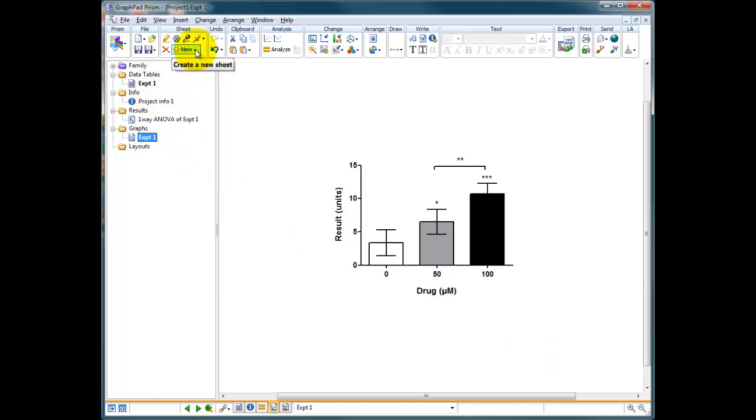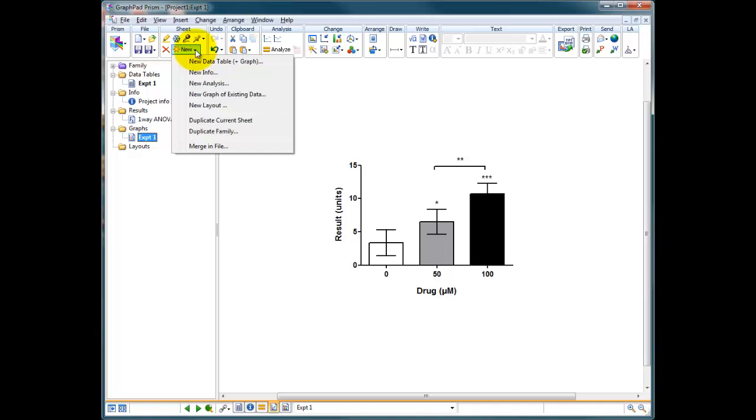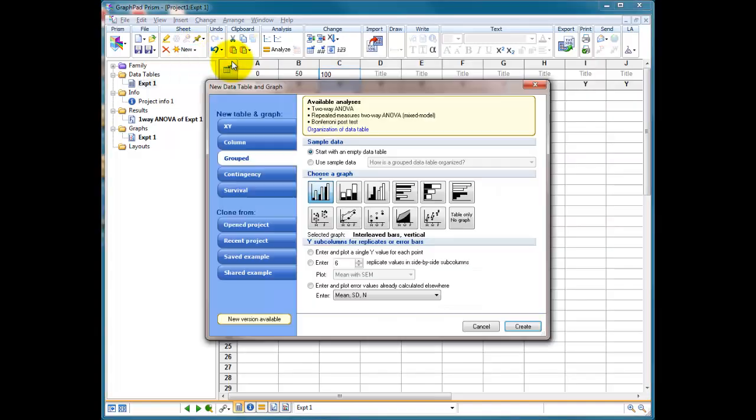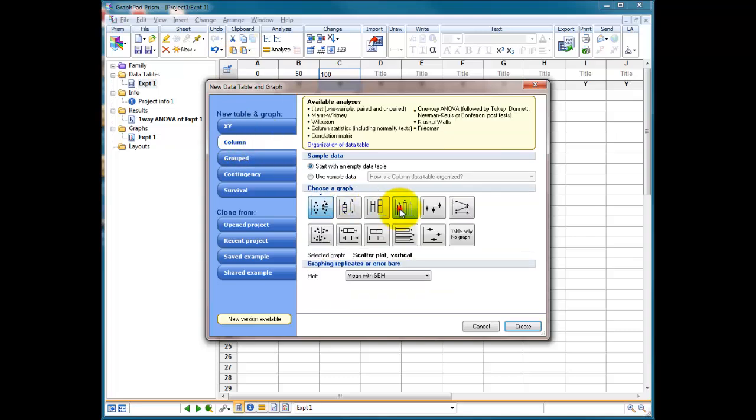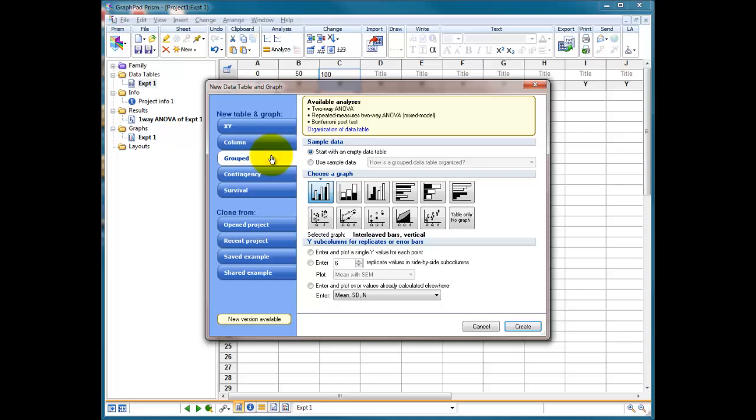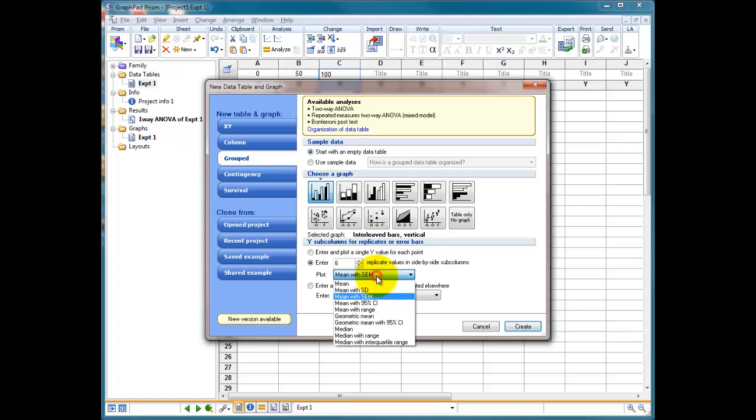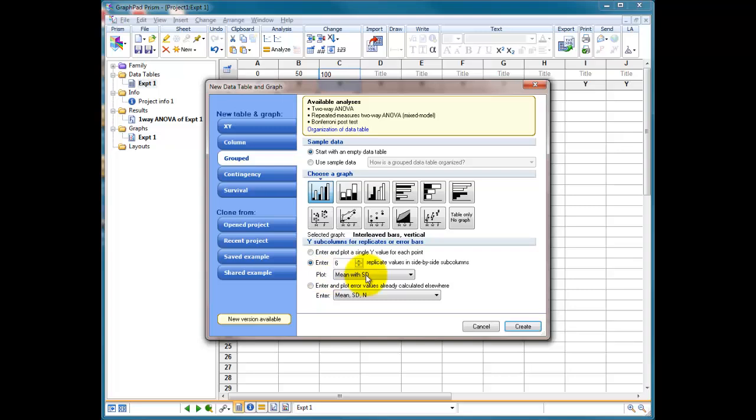So let's go to new and create a new graph and table for this. Click on new table and graph. And this time instead of being a column where we're choosing just a standard column, it's going to be a grouped analysis. So this time we're going to choose a graph and it's got a little picture here showing a white and a black bar next to each other in a group. And that of course could be your 0, 50, and 100 micromole with and without your inhibitor. Down the bottom here it's asking us now how we're going to enter these data. We're going to have six replicates showing mean and let's show standard deviation as well.